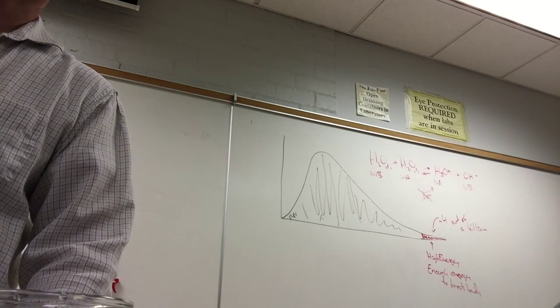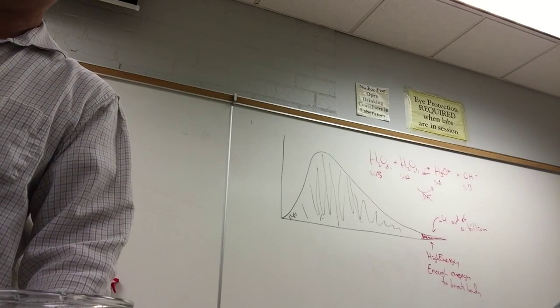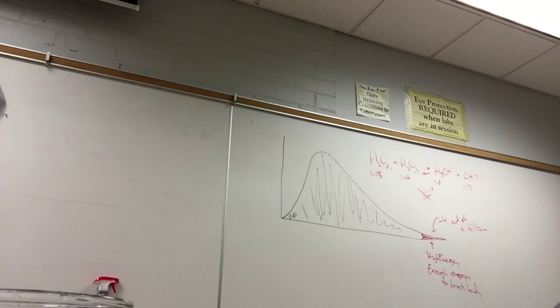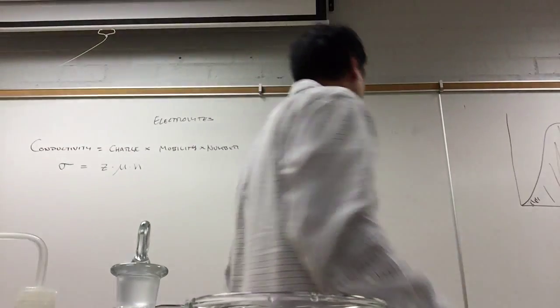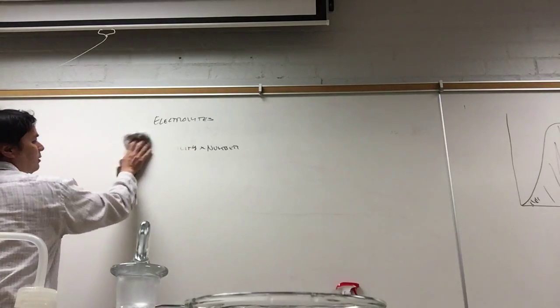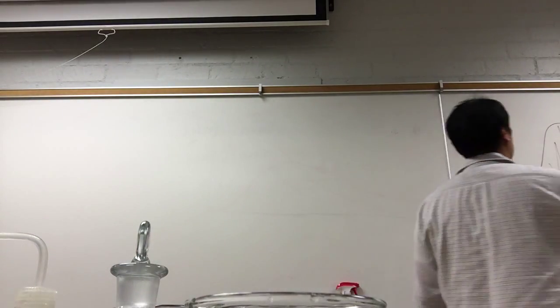All right, what's next? Potassium chlorate? Potassium chlorate we're going to do next time. Today, we're going to break up the lab into parts, and we aren't going to do the parts in order. The next thing we're going to do is go to the reaction. The first part is just to look at some electrolyte properties. The second part is to look at metathesis reactions, or double replacement reactions.